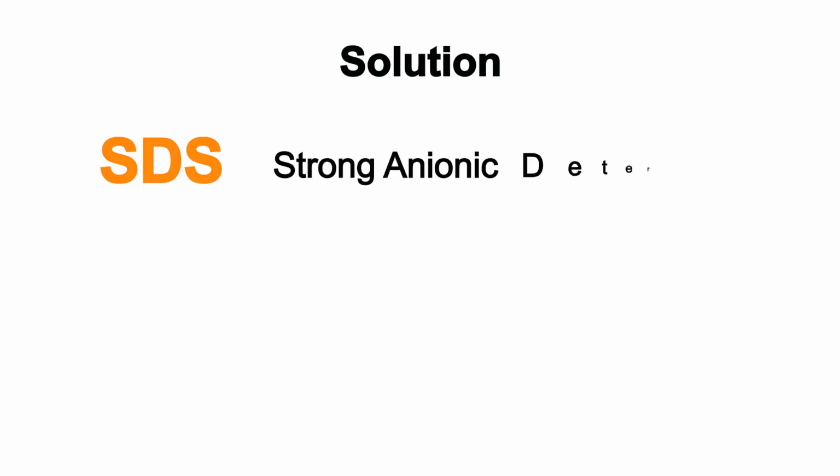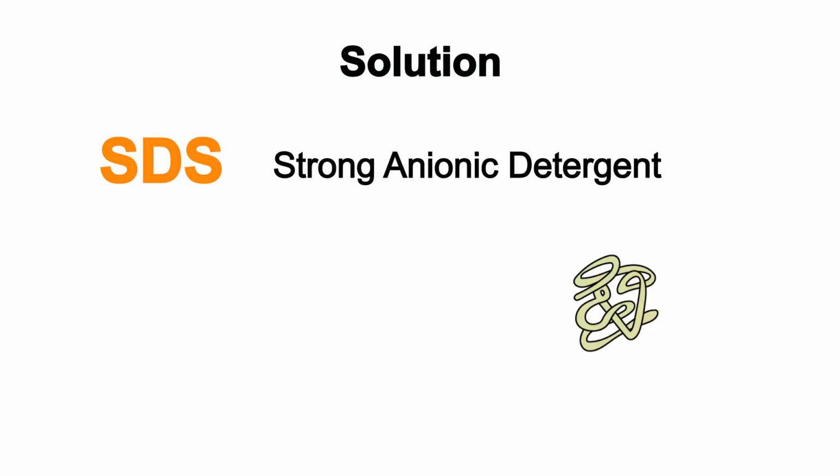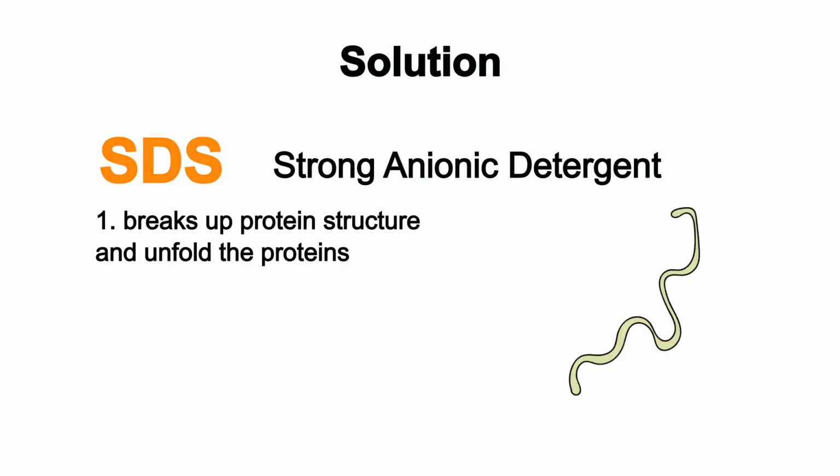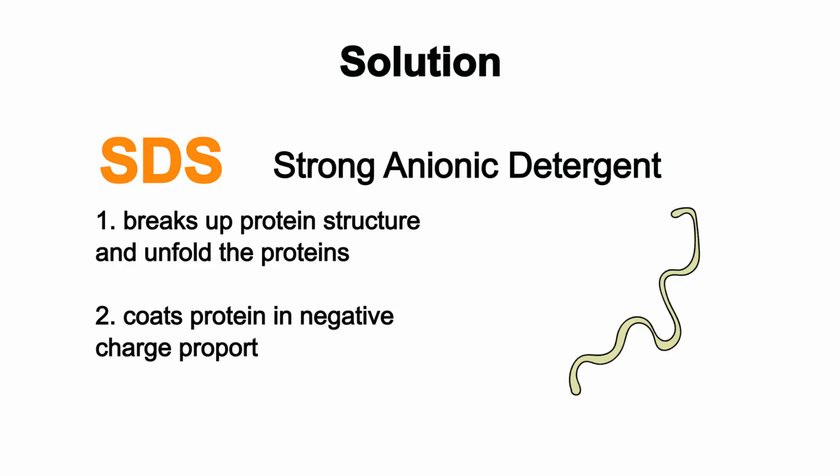The solution? SDS, a strong anionic detergent that performs two actions on the proteins in the mix. 1. It breaks a protein structure and unfolds the proteins. 2. It coats proteins with a negative charge proportional to their mass. Let's talk about the first action, unfolding the protein.